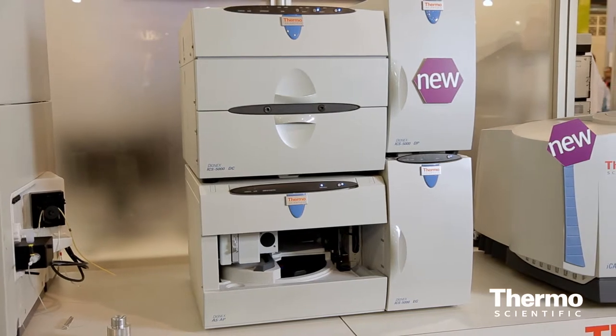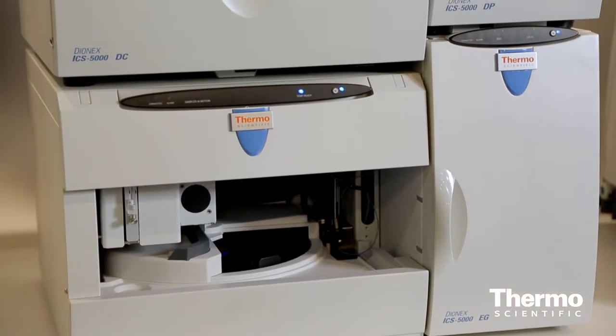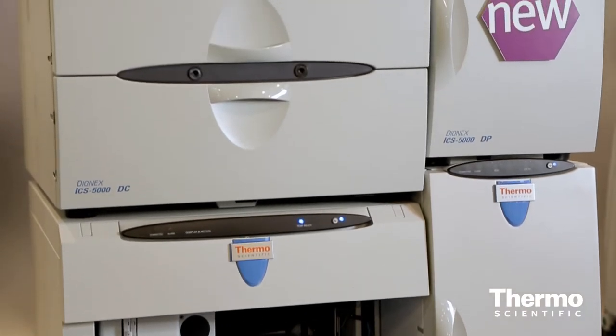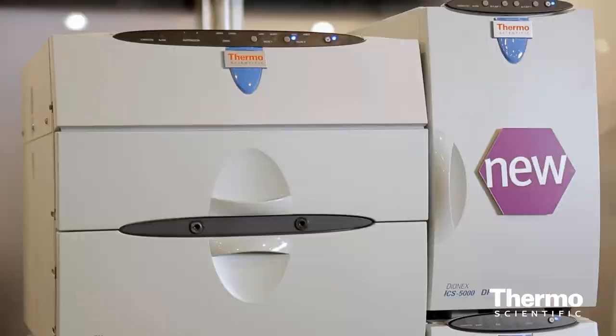The ICS5000 Plus is a new instrument we are showing for the first time here, and it adds on the ICS5000 but brings new HPIC capabilities to the analytical scale of ion chromatography. It gives a huge advantage in the area of very complex matrices such as food matrices, biological samples, and wastewater — one of our key domains for ion chromatography.